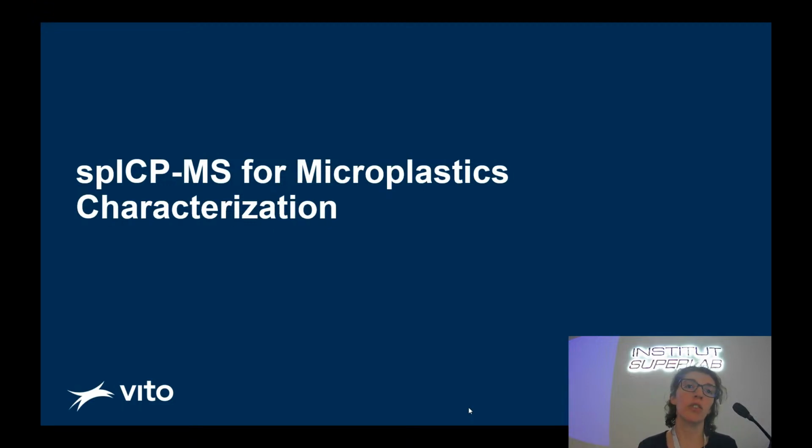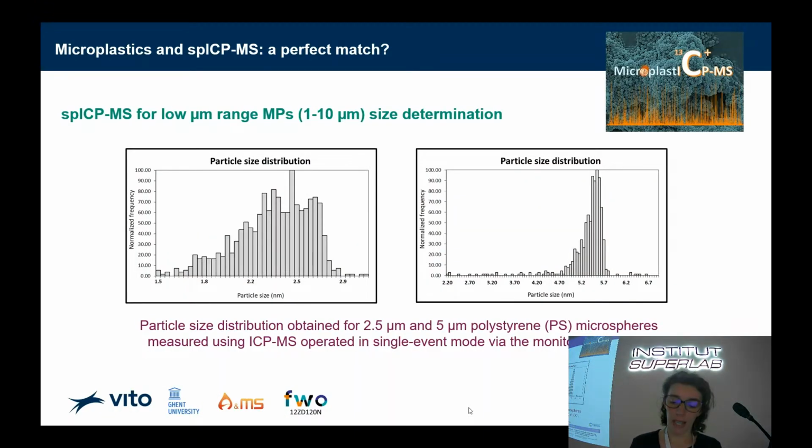There we really wanted to characterize the low micrometer range microplastics, meaning particles below 20 micrometers, basically to go below the range of the micro FTIR, for example.